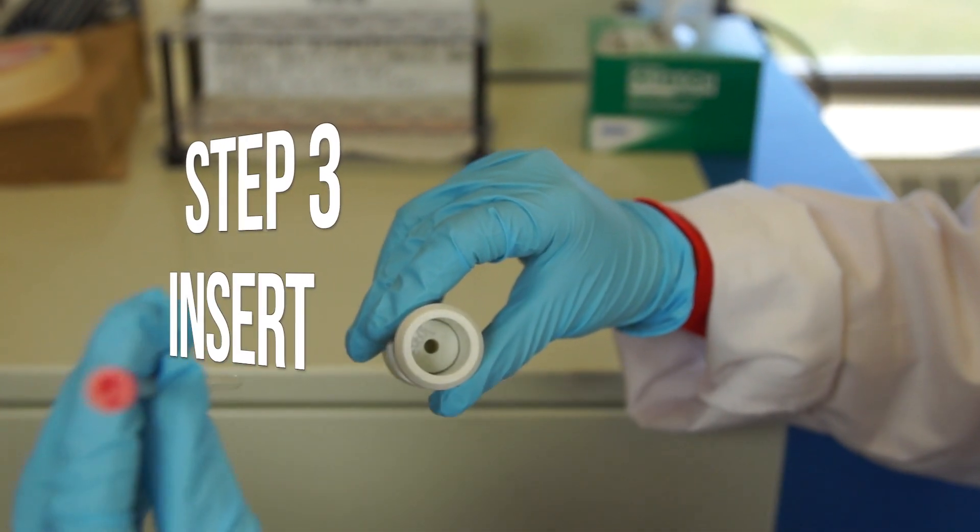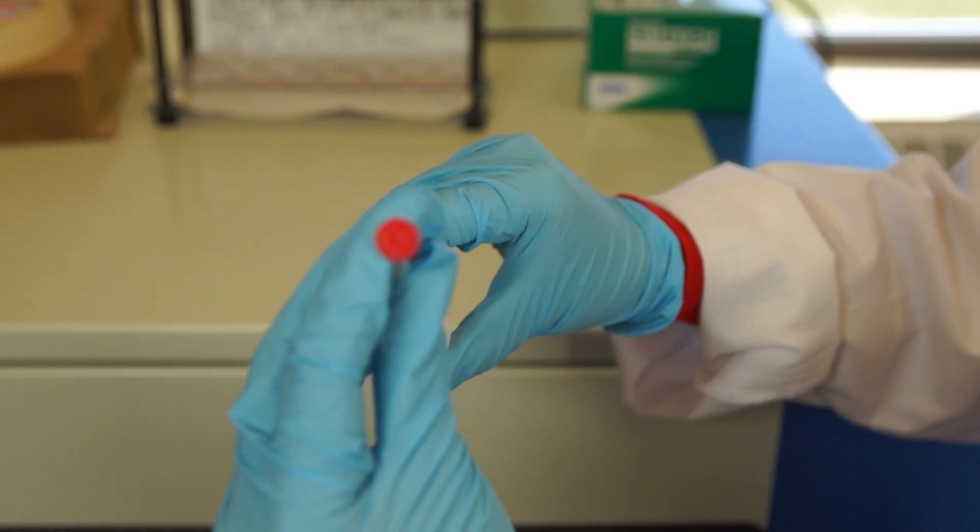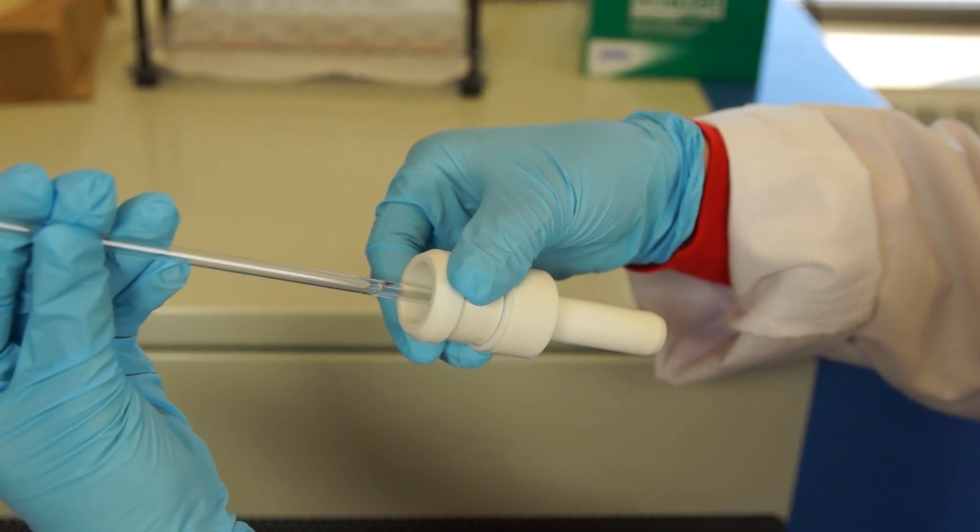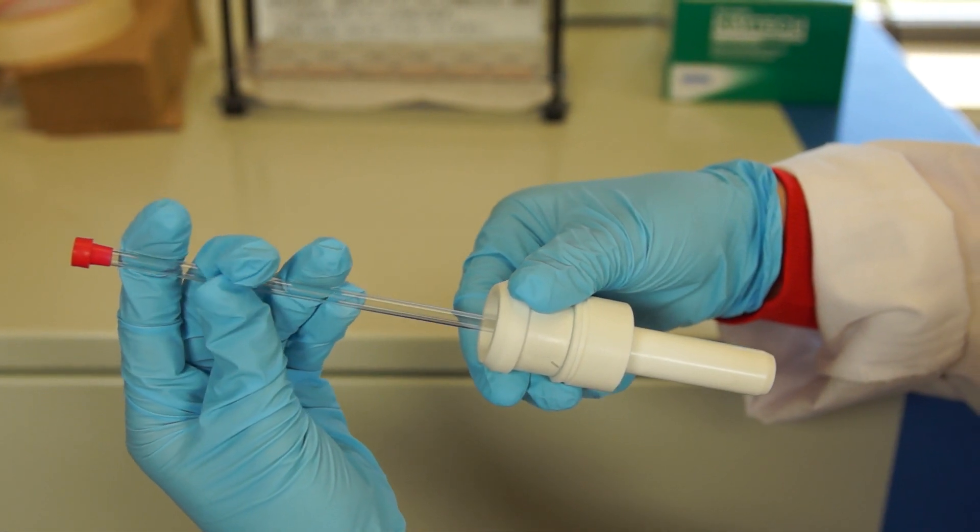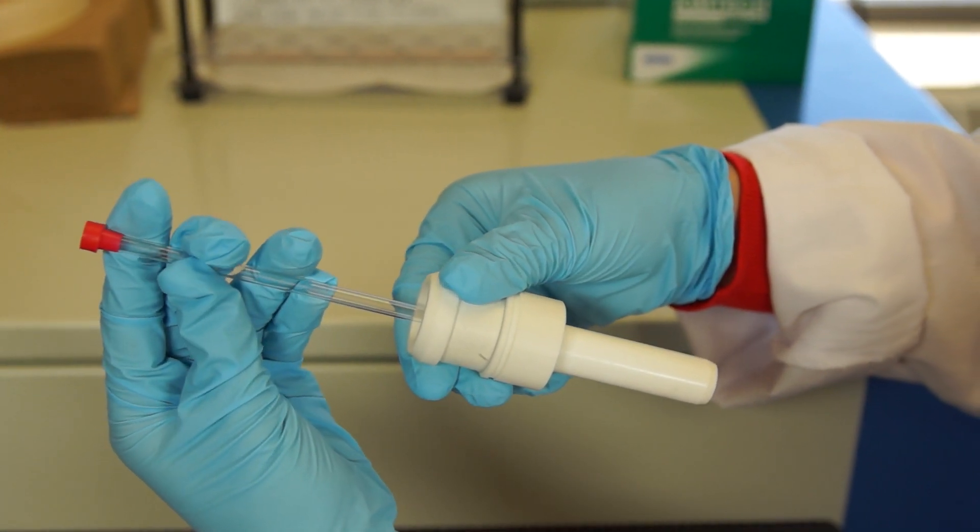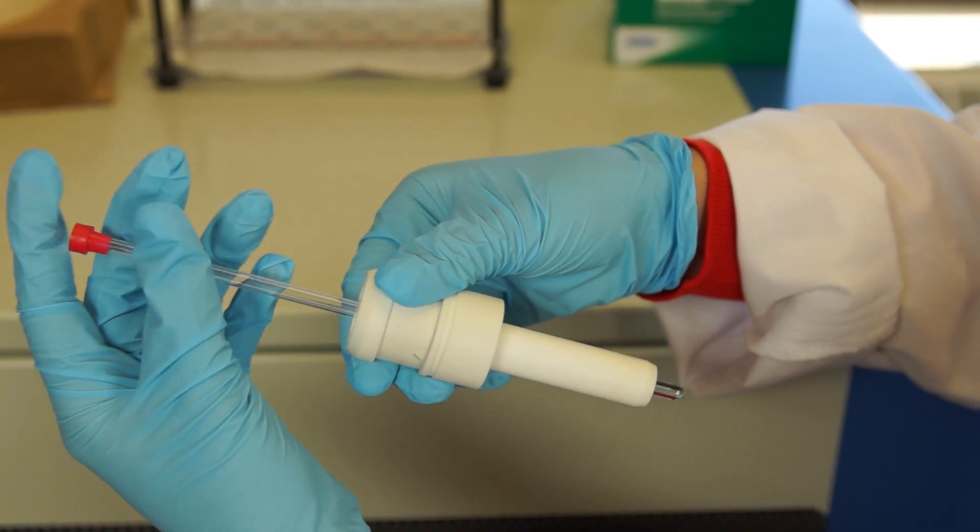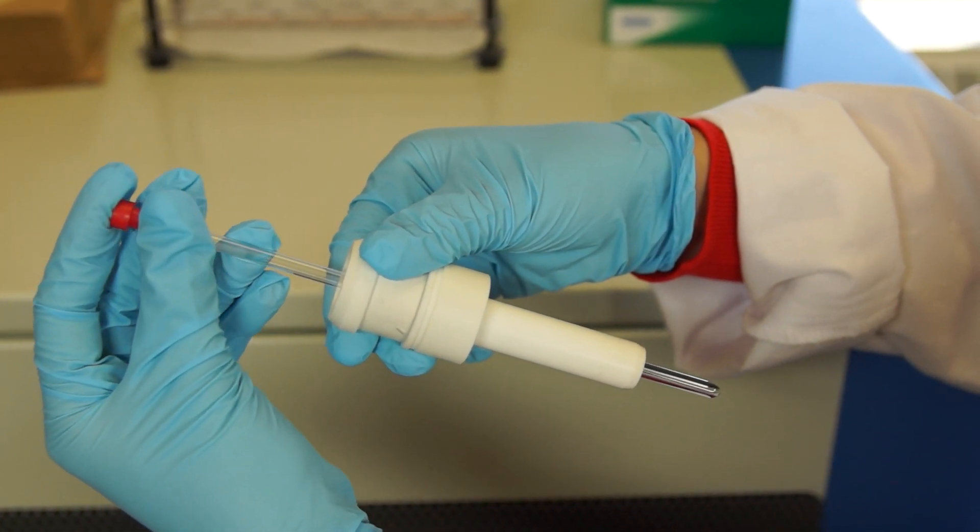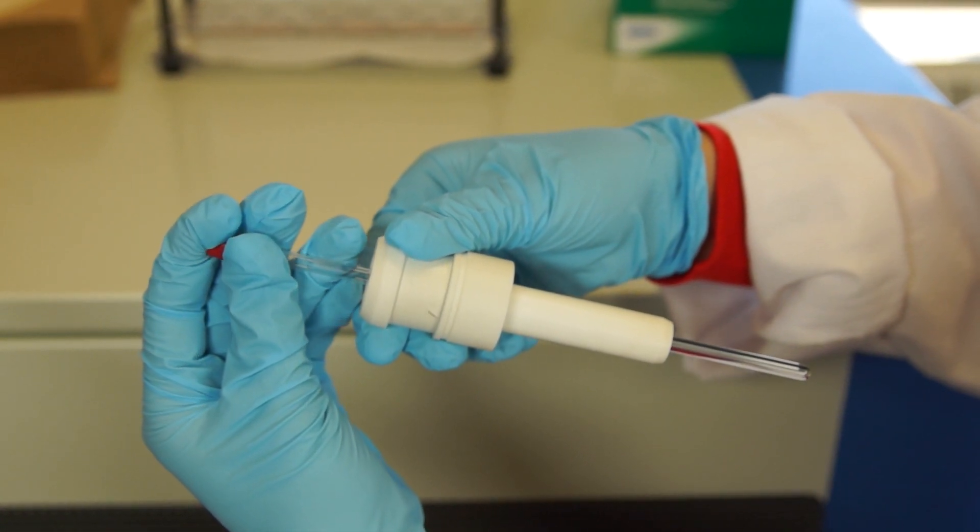Now, carefully insert the NMR tube into the NMR spinner turbine. Do this really gently with a slow twisting motion. You don't want the NMR tube to break during this step. Also, don't push the NMR tube down all the way.